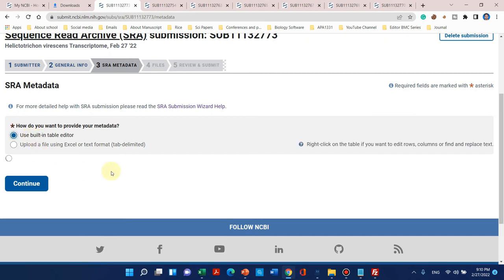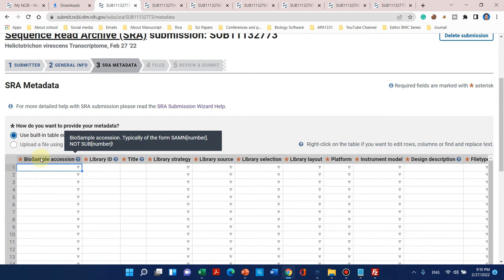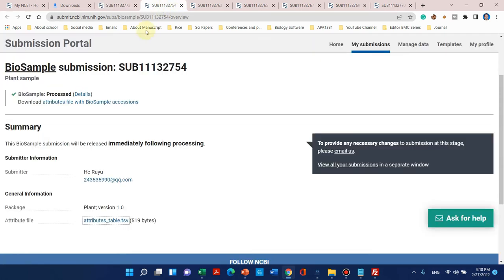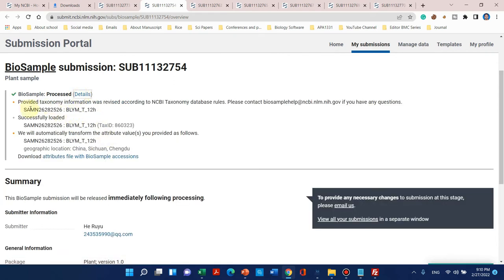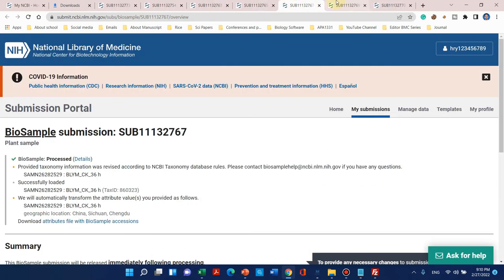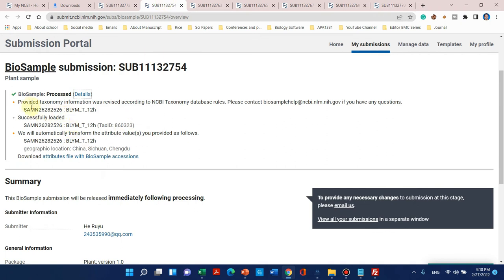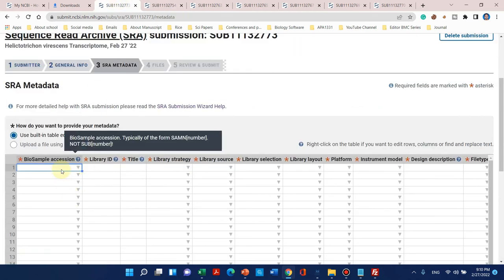Now we will move to the metadata information of the Sequence Read Archive. We can use the built-in table editor. Here we enter the BioSample accession number we saved earlier. The first BioSample accession number can be copied and pasted here. Now we need to create a library ID. We go back to our metadata file — we can choose any name for the library ID.